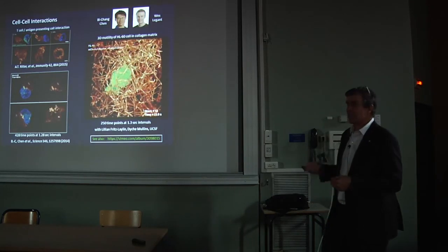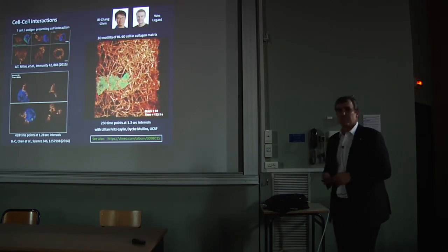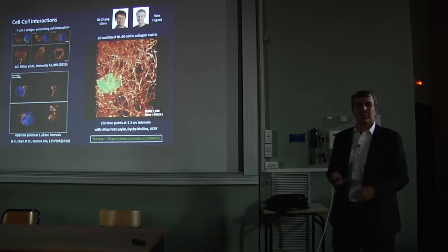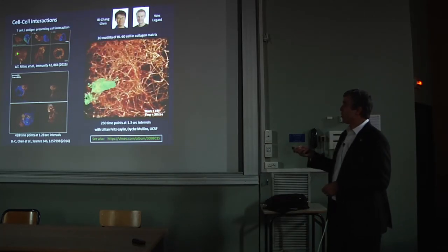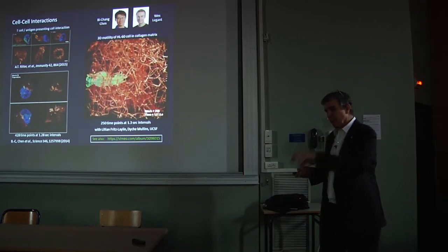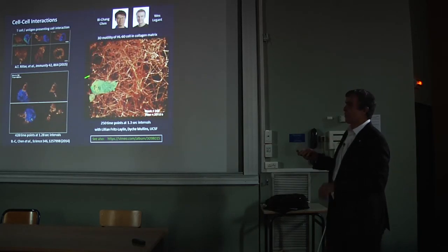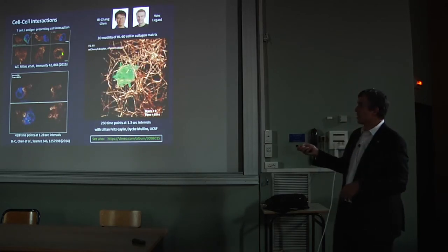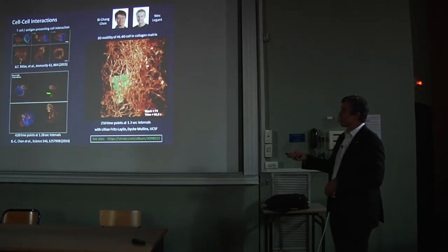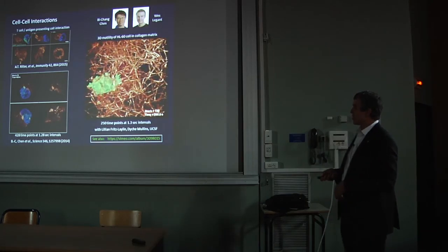So the next level up is to look at cell-cell interactions instead of single cells. So here's our good friend, the T cell we saw in TIRF SIM before, but now not against a coverslip, but against a real dendritic cell. And so as the immunological synapse forms, eventually before there's the cytotoxic granule release to kill the target cell, there's an opening up of the actin like a lamprey or something there in order to be able to deliver it. We also find this extremely fast flow of actin away and along the sides of the T cell.